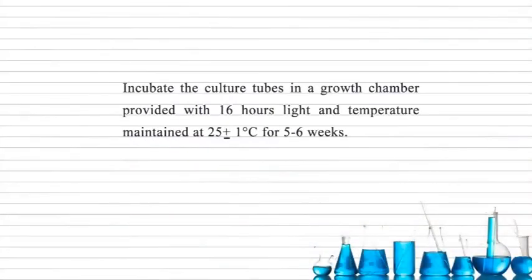Now incubate the culture tubes in a growth chamber provided with 16 hours light and temperature maintained at 25 ± 1 degree Celsius for 5 to 6 weeks. Observe the cultures every week.